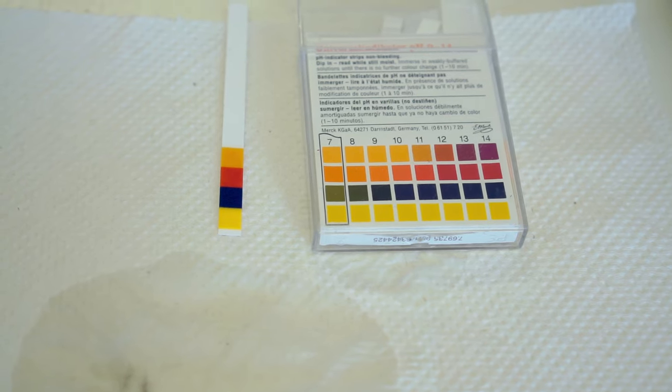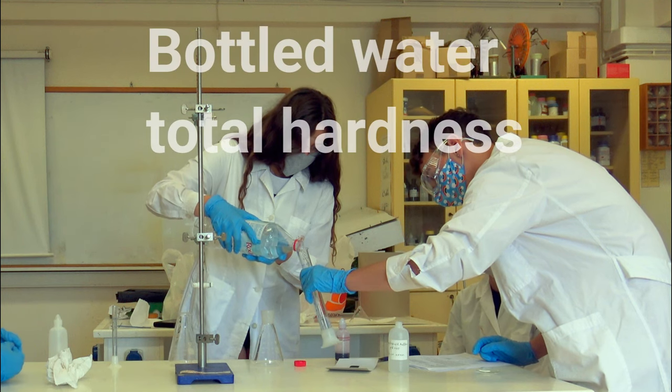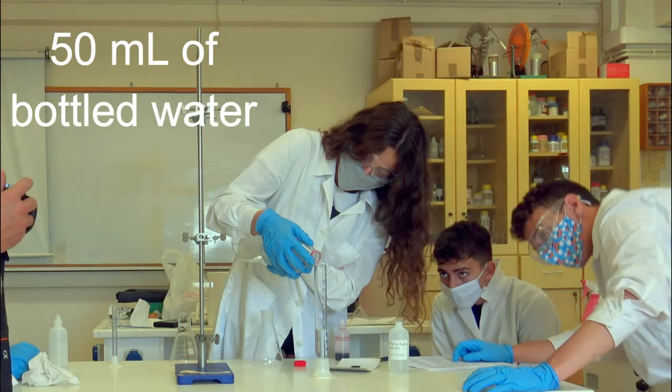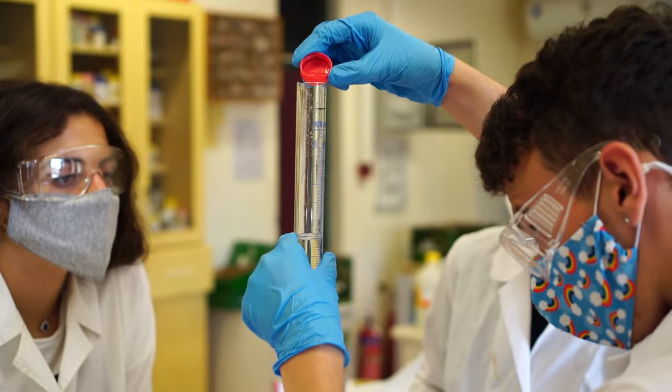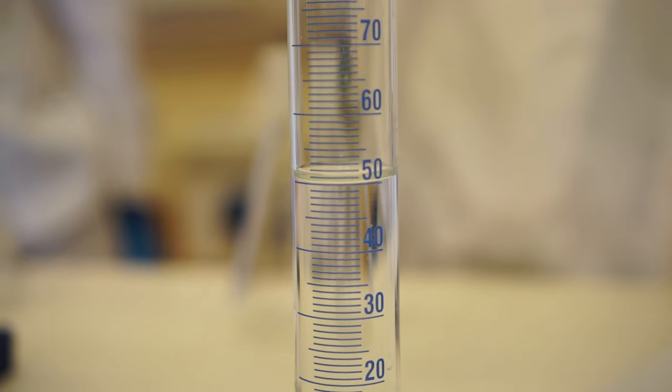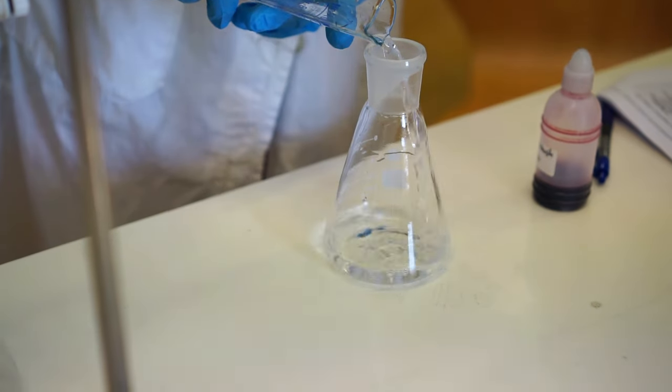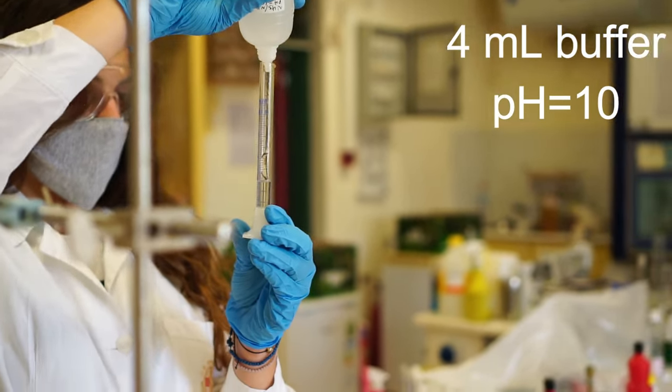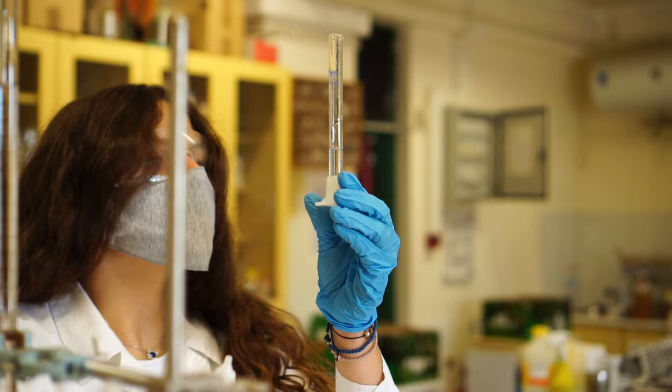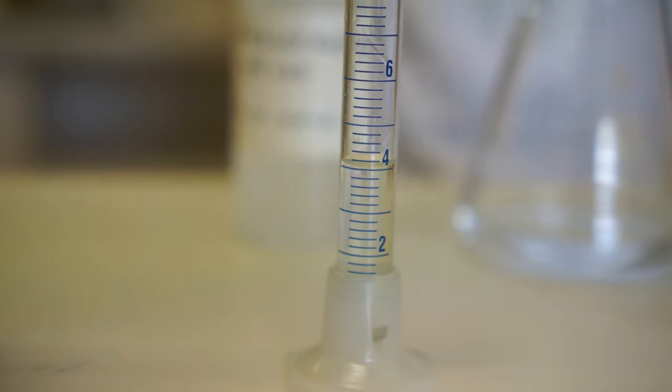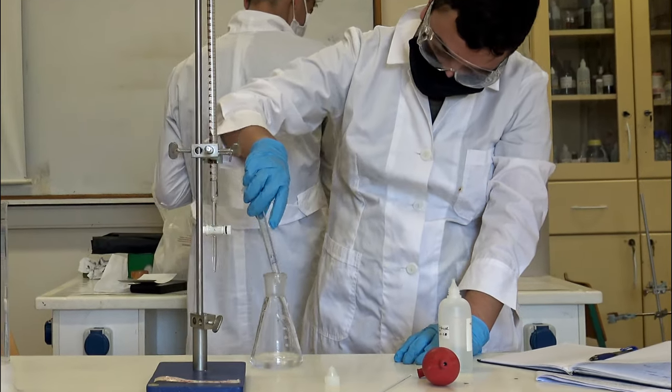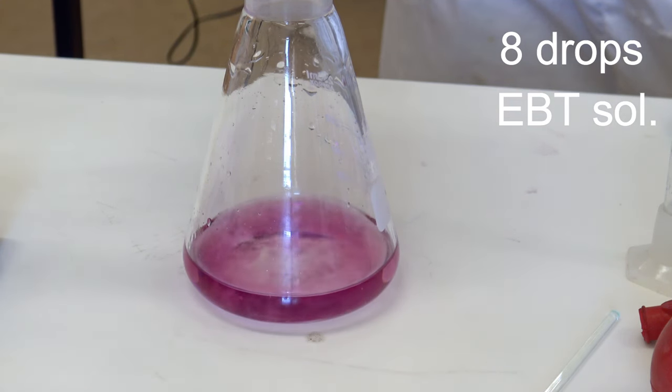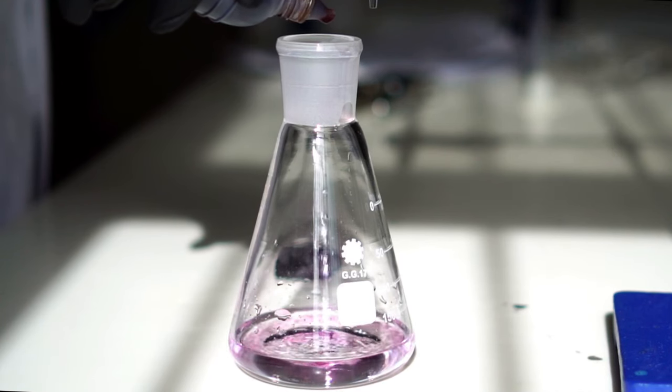First we analyzed some bottled water. Using a graduated cylinder, 50 ml of water are brought in a conical flask. Well, that was not really straightforward. Then we add 4 ml of buffer. And finally, 8 drops of the EBT indicator.